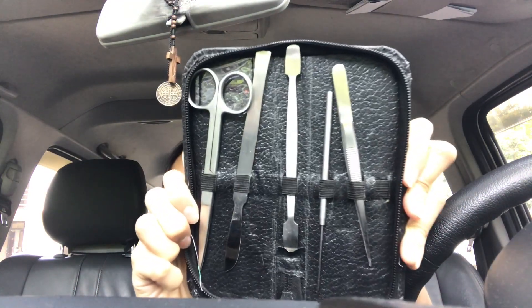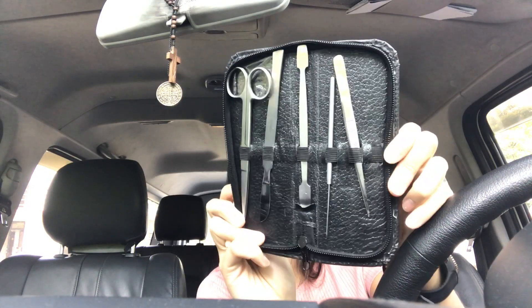Pinadala kami ng 30 cockroaches and ng dissecting kit. So, if you guys want to know kung ano yung iturin ng dissecting kit, I'm going to show you guys. Ito yung dissecting kit ko. And I'm going to open it. So, I use this during my laboratory classes. Ganyan yung iturin niya. I actually bought this from Mercury Drug lang, and I have this already. Nasa akin na to ever since I was a freshie, because I bought it sa Mercury lang for one of my classes.